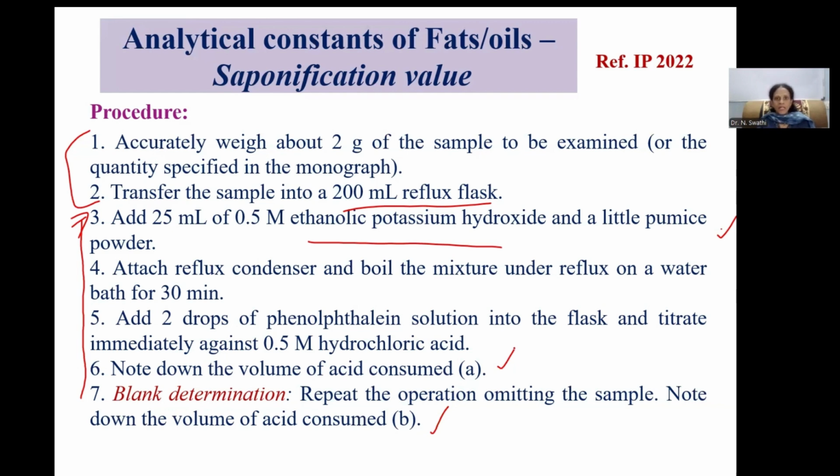Once you start titrating with HCl, slowly whatever leftover potassium hydroxide is there will undergo neutralization. Once the neutralization point is reached, if you keep continuing the titration, the excess drops of hydrochloric acid added to the flask make the pH of the environment acidic. In the presence of acidic pH, phenolphthalein shows colorless.